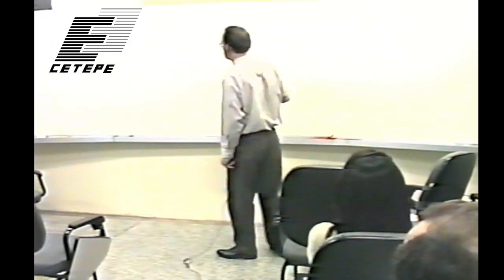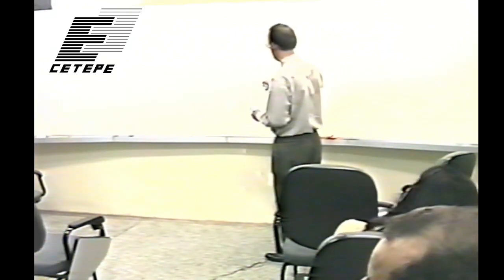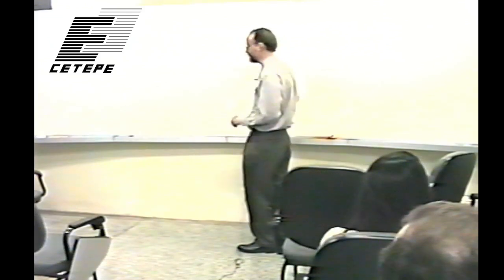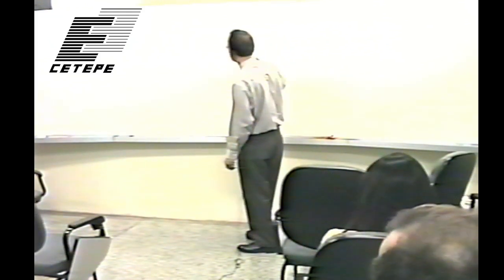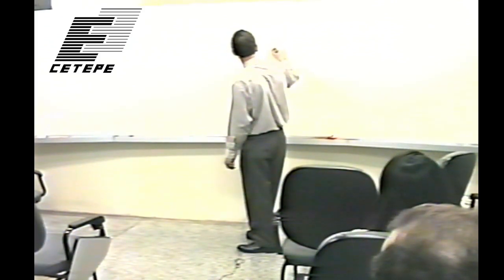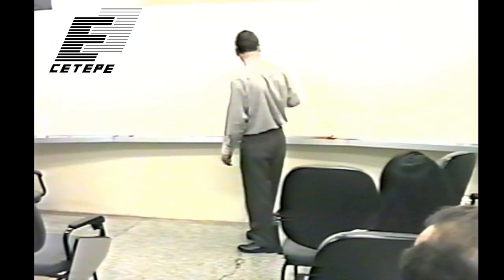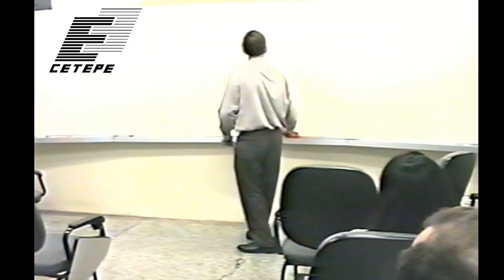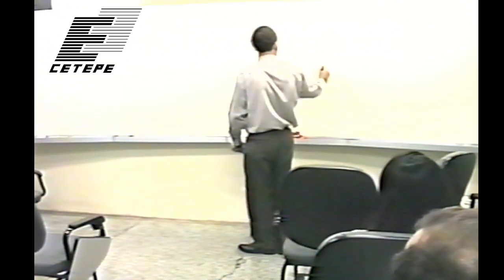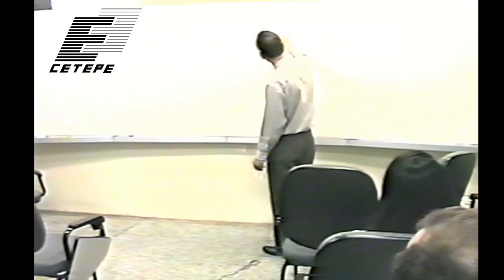So the spectrum might be altered to, I'm not a very good artist, and don't take the exact form of these spectra seriously, but it's going to absorb more strongly here. It's going to reduce all of this somewhat, but it's going to mostly make a dent in the spectrum here.